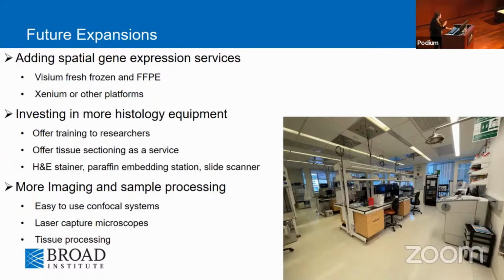If you come in, you can section your tissue, you can image it, and you can also do the quality assessment checks on those tissues to see if they're worth even sectioning on the BioA. And then, to do more of this, we want to obviously have some confocal-based systems as well to help with imaging. And Leica has just released a new, very easy to use imager called Omics, just launched a couple of weeks ago in the US. We're also looking at laser capture microscopes because you want to be able to do single cell proteomics and help those groups out potentially. But they're also useful for other things. They're actually pretty cool. I just demoed it last week where it cuts out very precisely little pieces of tissue, pops it out into a tube.